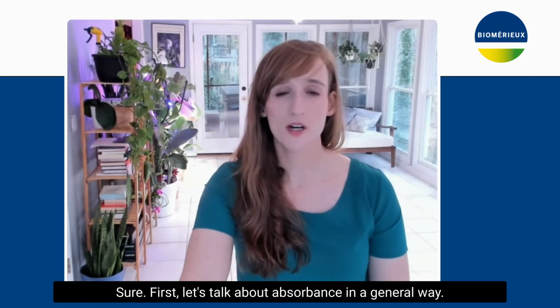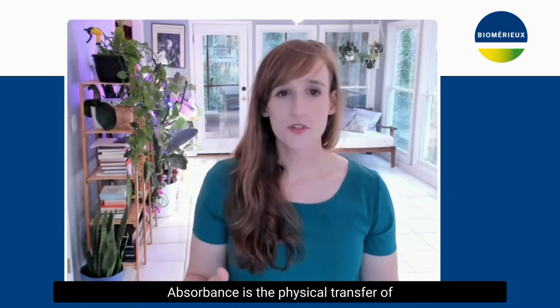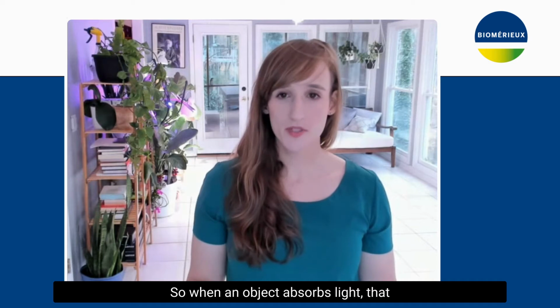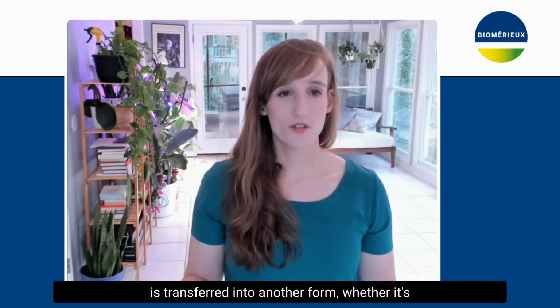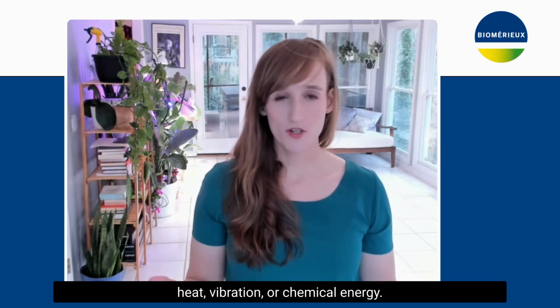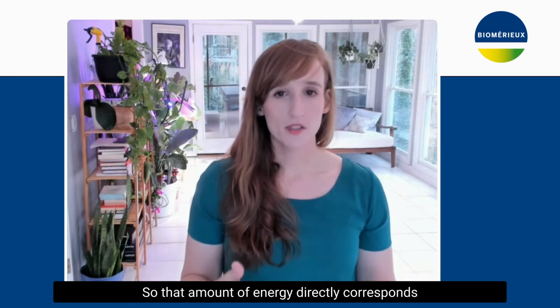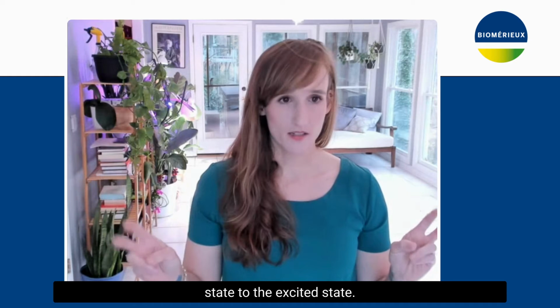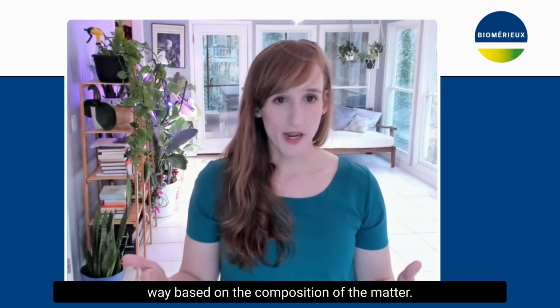Sure. First, let's talk about absorbance in a general way. Absorbance is the physical transfer of energy from light into matter. So when an object absorbs light, that energy from light at a particular wavelength is transferred into another form, whether it's heat, vibration, or chemical energy. That amount of energy directly corresponds to the electronic transition of the ground state to an excited state. That transition occurs in a predictable and repeatable way based on the composition of the matter.